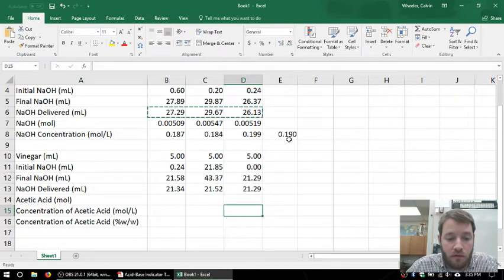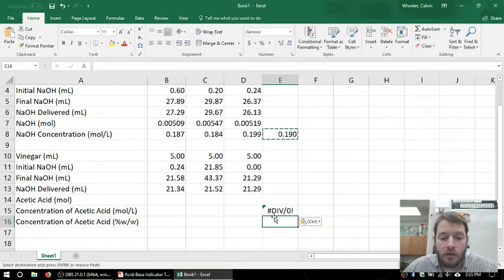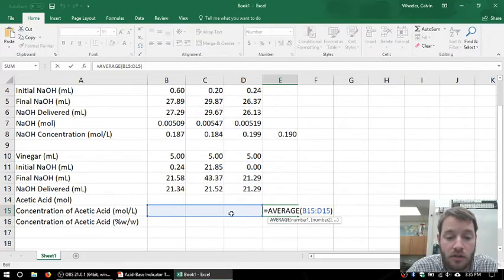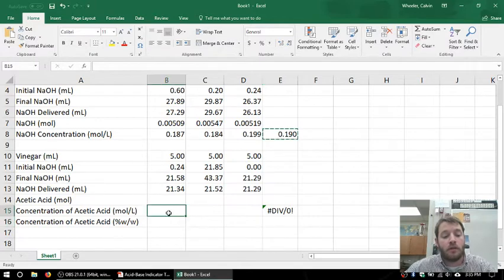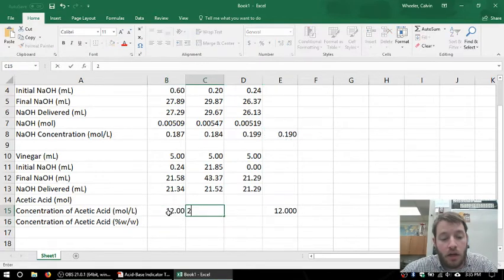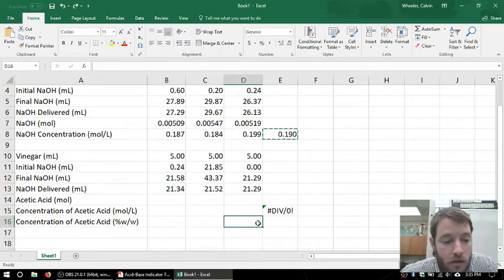I'm also going to have an average, so I can actually pull that calculation from up here, because I'm going to use that. It says #DIV/0!. Divide by 0. That means divide by 0 error, because if I average these three and divide by the number of things I have, well, it's going to be 0 plus 0 plus 0 divided by 0. So that's why it's saying that. But once I fill in data, it will automatically fix that. That's not my actual data though.